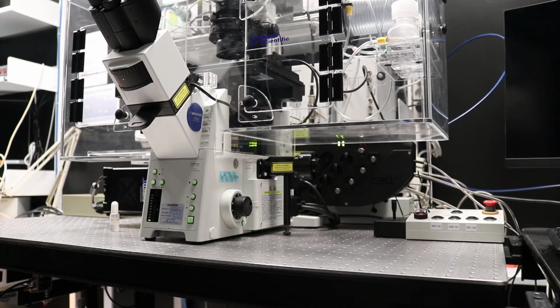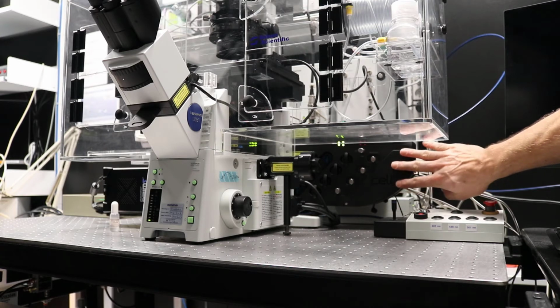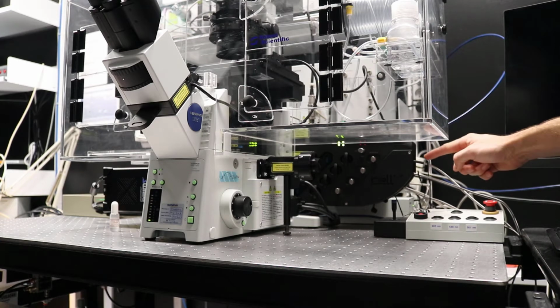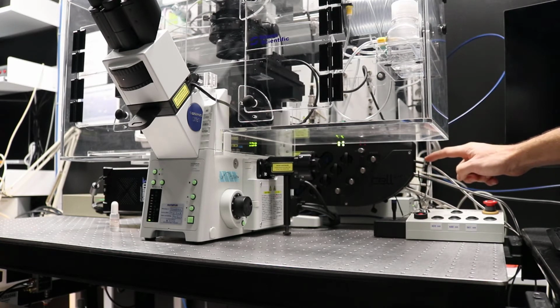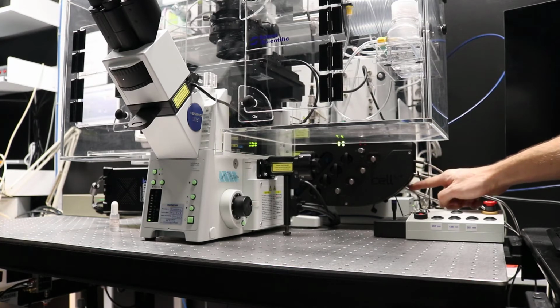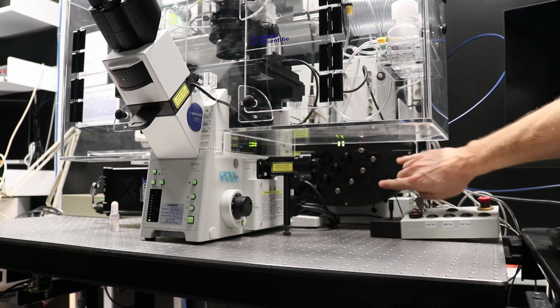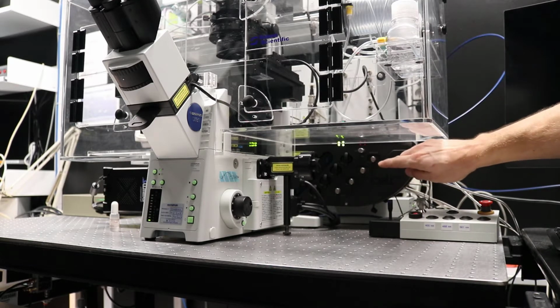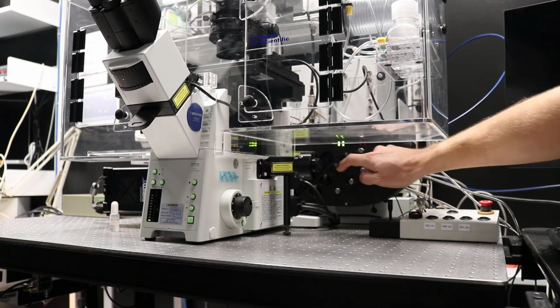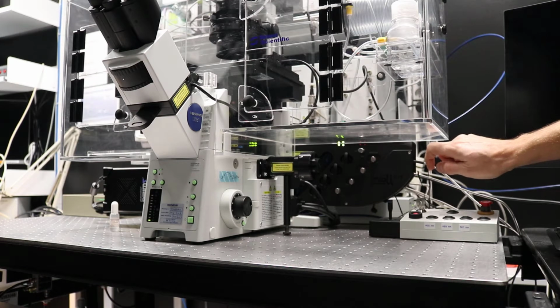So the special thing about this system is the TIRF condenser. It's a black piece behind the microscope here, and you see the light guides coming in. So this is the 3 laser lines: the 405 laser, the 488, and the 561 laser going in here, and they need to be aligned perfectly for the best TIRF angle. And that is done here, and I will show you that in another tutorial.